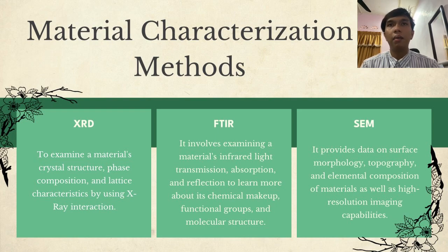As for SEM, it provides data on surface morphology, topography, and elemental composition of a material as well as high-resolution imaging capabilities.